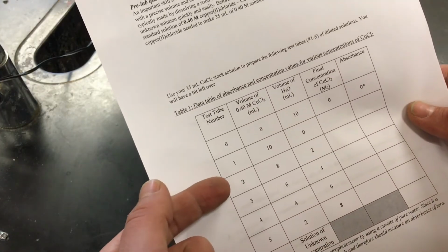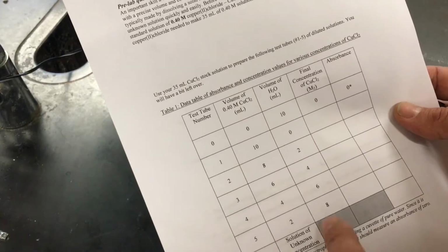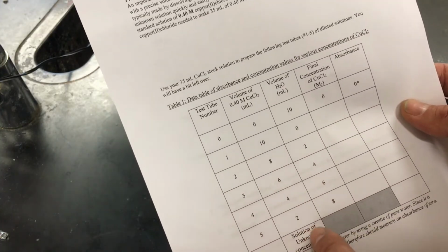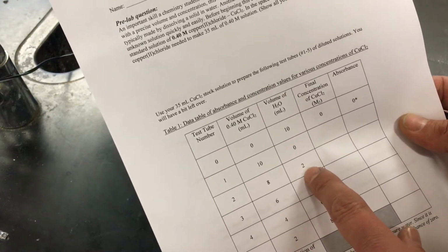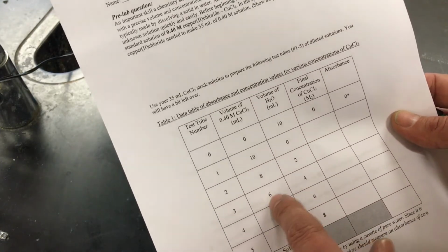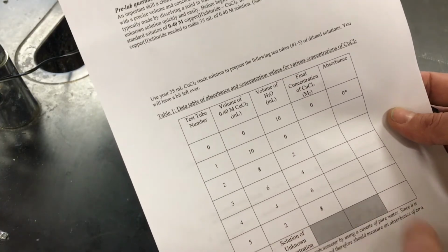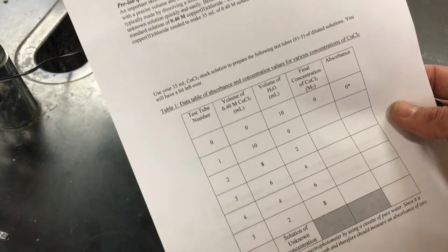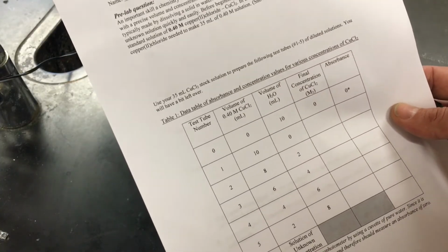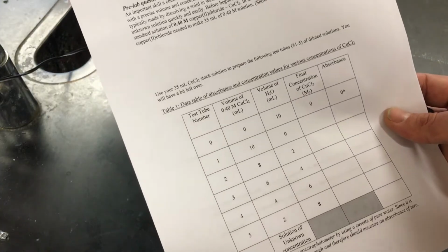But then for test tubes number 2, 3, 4, and 5, we're going to dilute the stock solution: 8 milliliters of stock plus 2 milliliters of water, 6 of stock and 4 of water, 4 stock, 6 water, 2 stock, 8 water. So you can see when we do these dilutions that the total volume after the dilution is always going to be 10 milliliters.